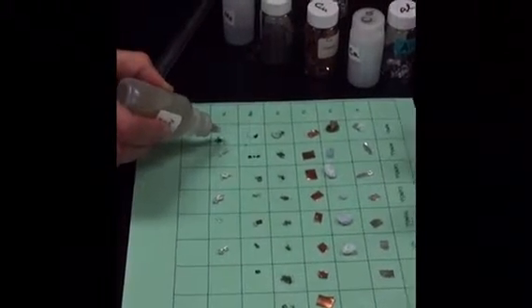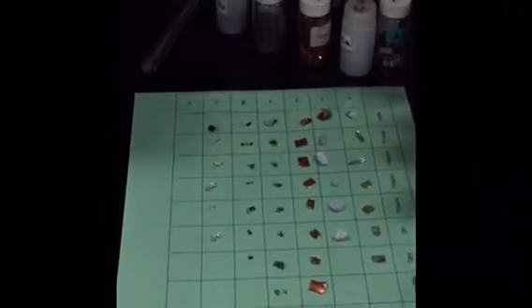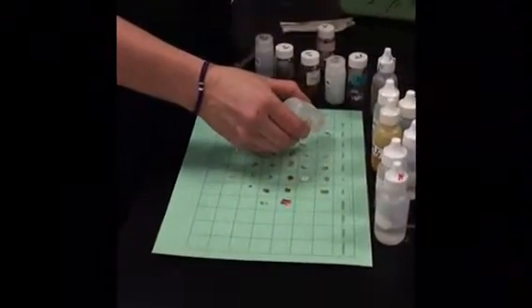Remember what evidence of chemical change we can see. We're looking for precipitate forming, we're looking for bubbles, we're looking for color change, we're looking for heat evolved, we're looking for anything that indicates a chemical change.